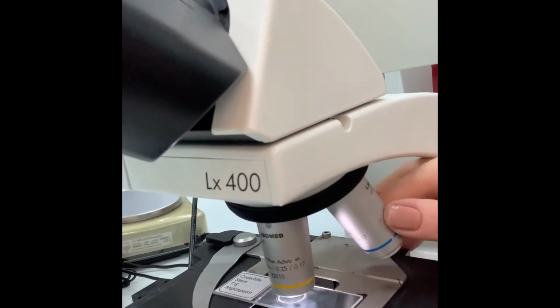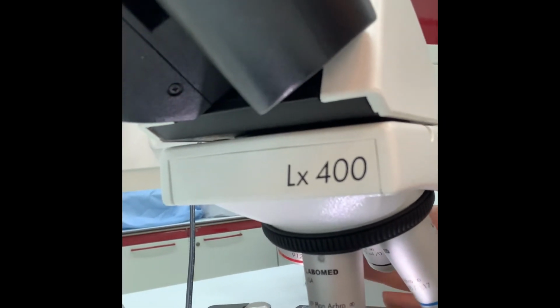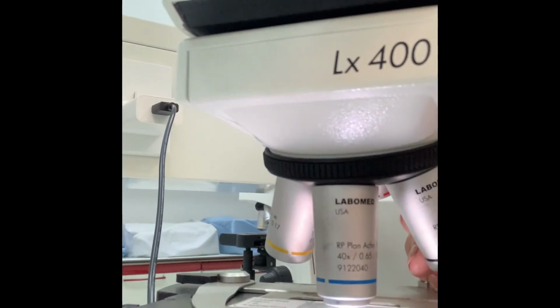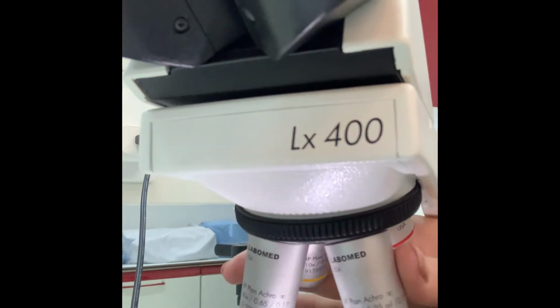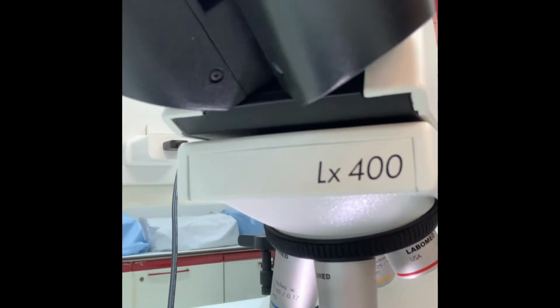Now when I move it, see, still it won't touch. It's not touching. But when I go for objective 100, it will touch the slide.